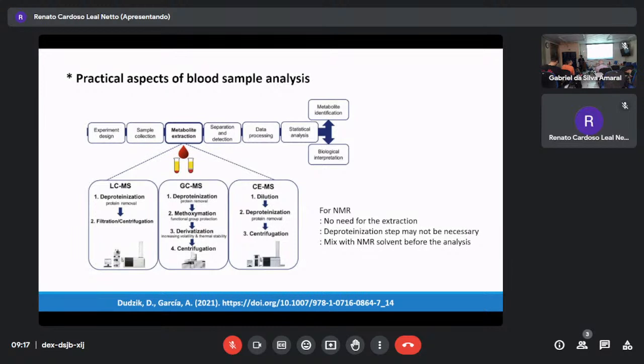You can use an external reference if you want, so you don't need to put D2O or any different solvent. You just put a capillary inside and take the urine in that. But there is a little bit of a shimming issue, because of that problem.